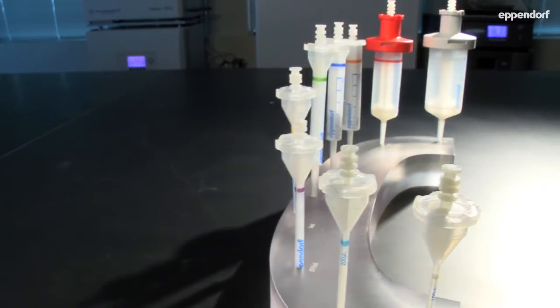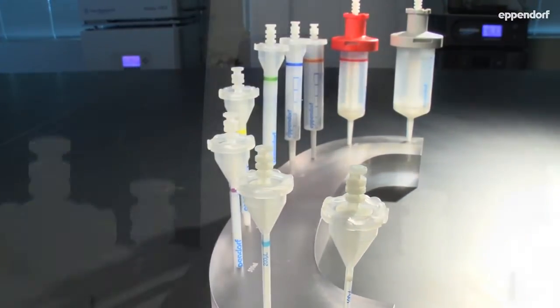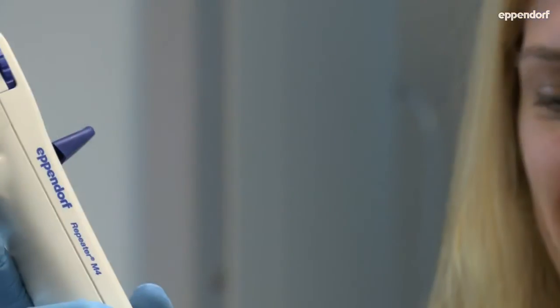With 9 different CompiTip Advanced volumes to work with, from 100 microliters to 50 milliliters, no application is out of reach for Eppendorf's Multipet M4.